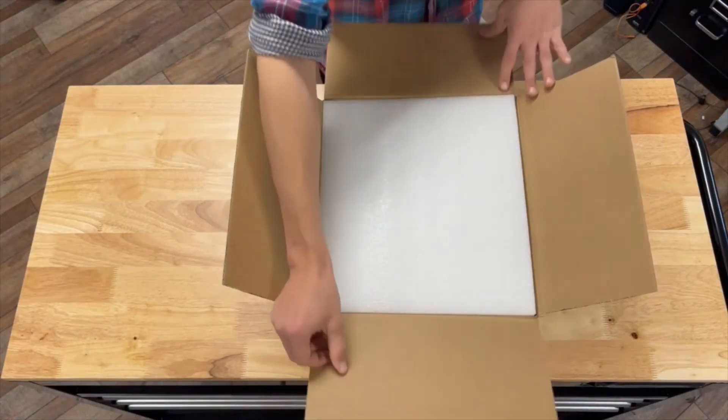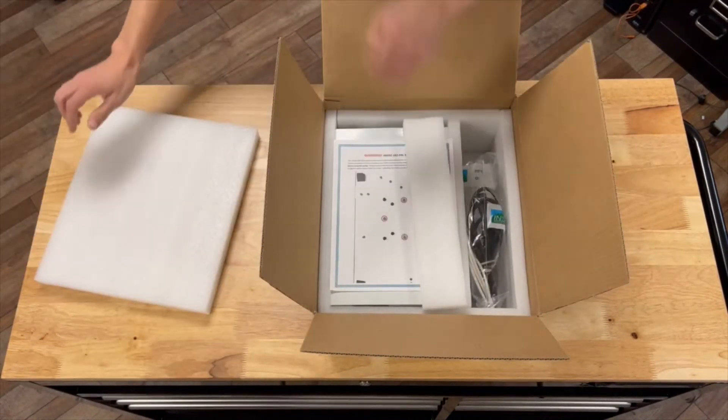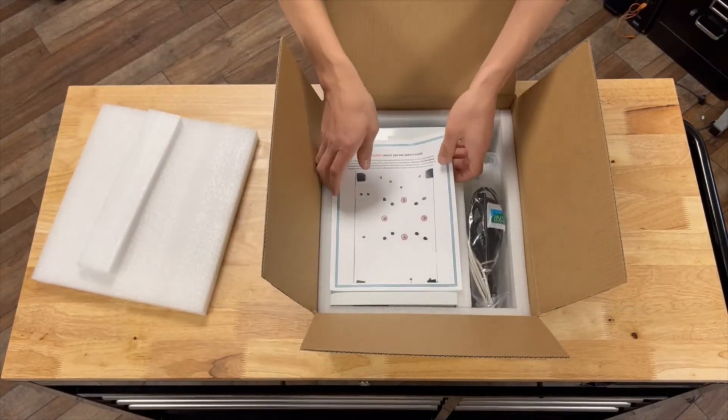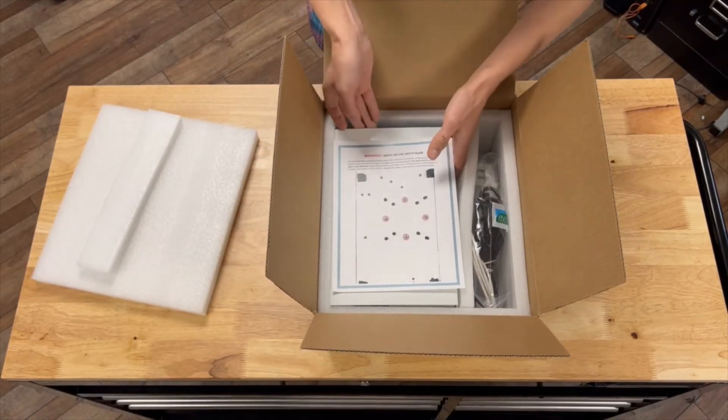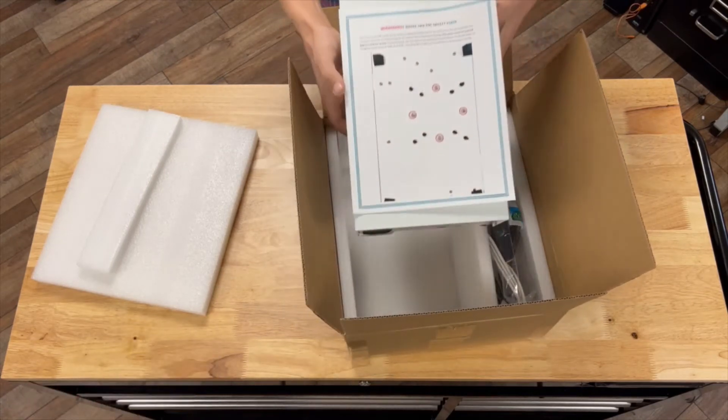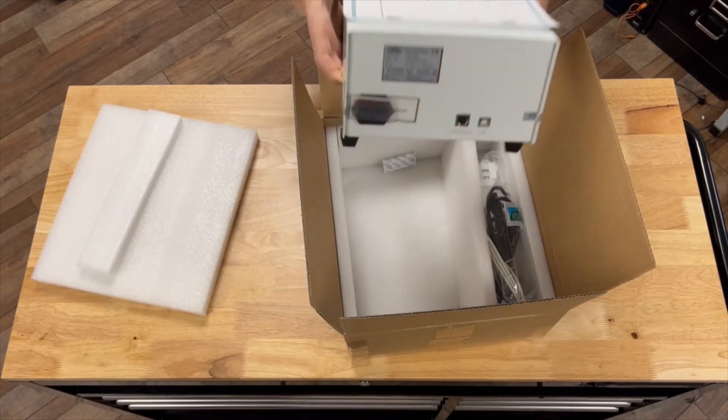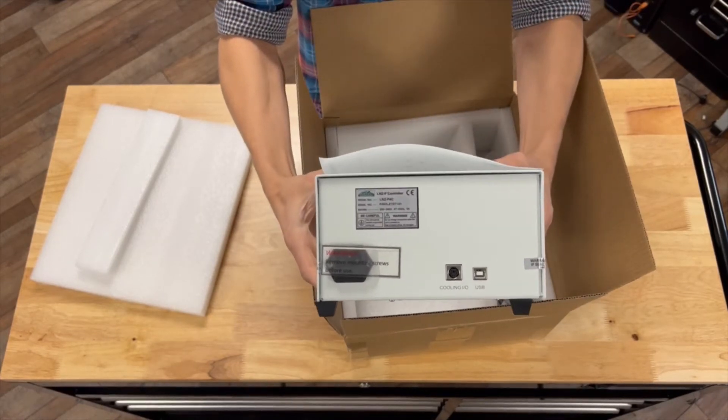An important first step of the setup is identifying and verifying all system components are present. Begin by removing the suction pump. A notice will be included which informs the user to remove all four mounting screws from the underside of the pump. There is also a sticker with the same message covering the power plug.